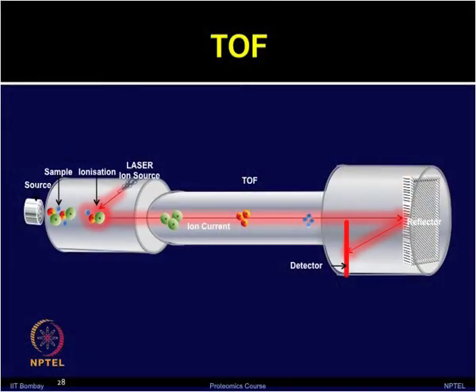In TOF, the ions are accelerated to high kinetic energy, and due to their different velocities, they are separated in a flight tube. One can also use a reflectron mirror, so that ions can turn around in a reflector, which can compensate for minor differences in kinetic energy and provides a longer separation.